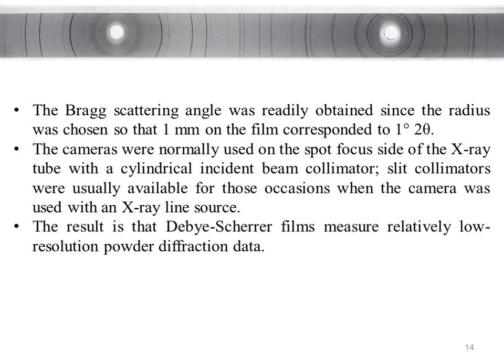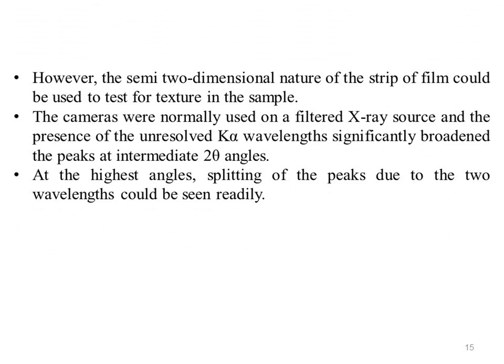Although the collimators cut down on air scatter, they have little focusing effect. The result is that Debye-Scherrer films measure relatively low resolution powder diffraction data. However, the semi-two-dimensional nature of the strip of film could be used to test for texture in the sample. In addition, the film measured the full 360 degrees of scattering, thus providing reasonably accurate lattice parameters from the very high angle reflections.